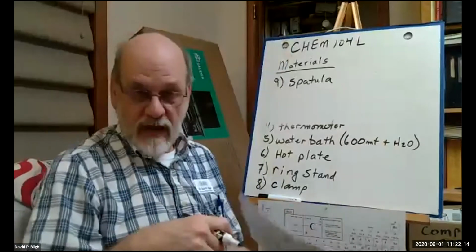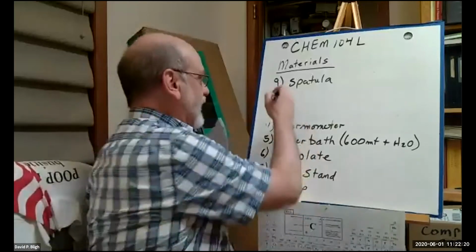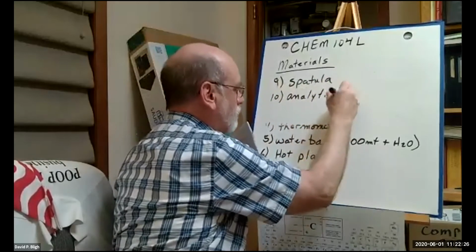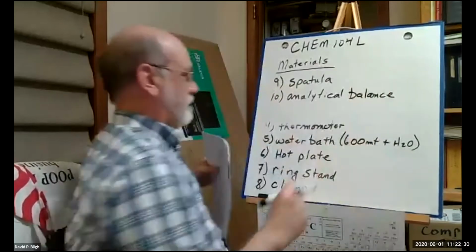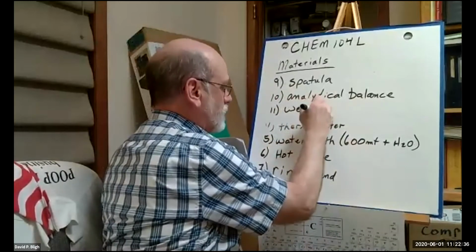Well, we're going to be weighing our solvent and solute on an analytical balance. Right? So we need the balance, and we need weigh boats.